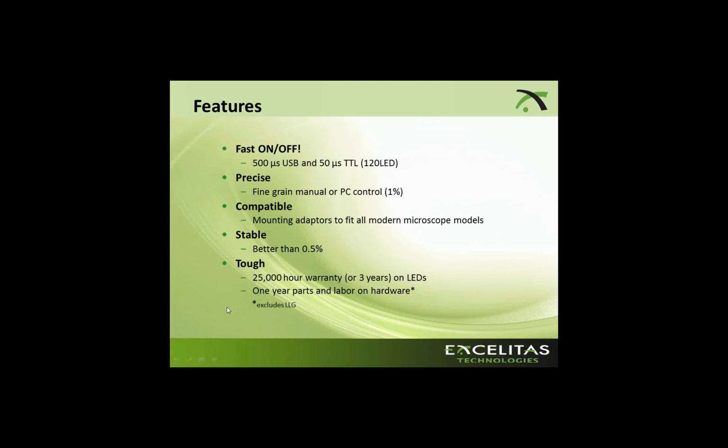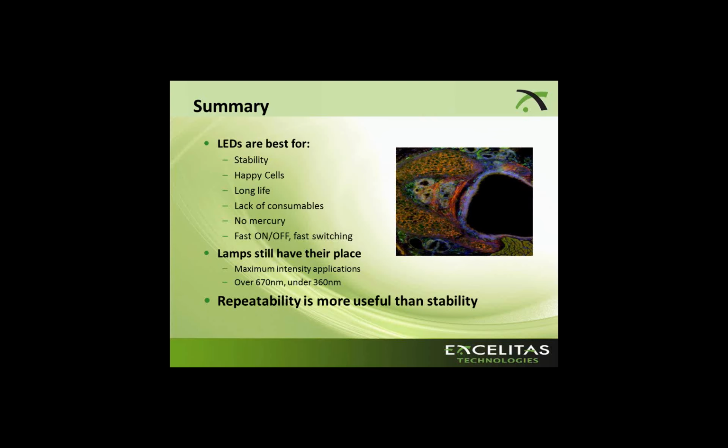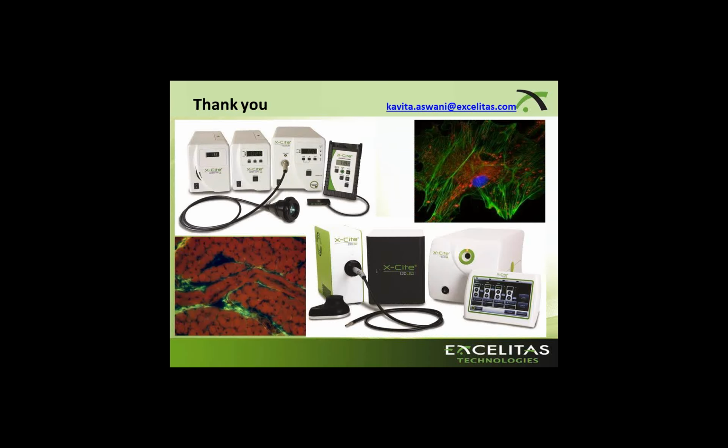And hopefully this background on LED technology will enable you to think that it's not scary technology, it's actually useful. And depending on your application, it might be better than lamps. And just to conclude, I hope it has been conveyed that repeatability is a much better measure than stability as far as imaging goes with microscopy and fluorescence. So I thank you, and if you have any webinar comments or questions that are not answered here, please email me, that would be great.